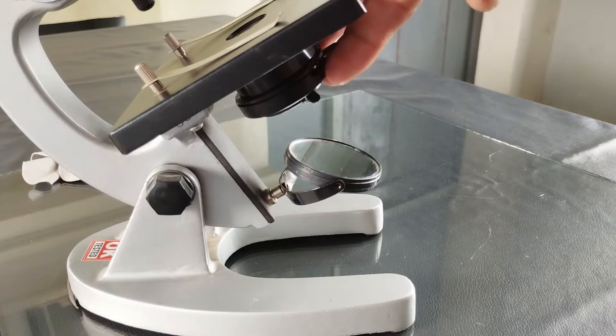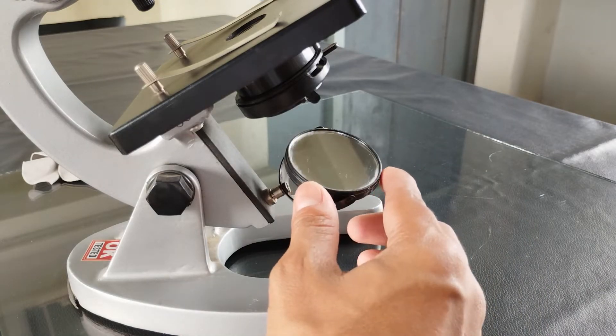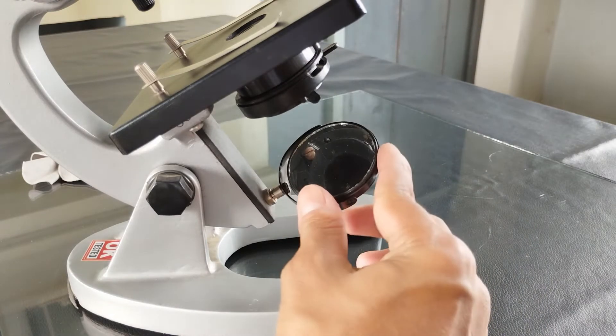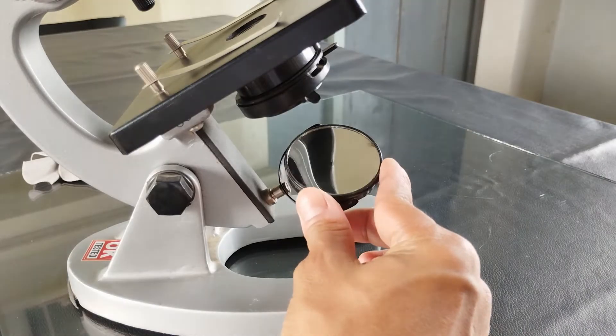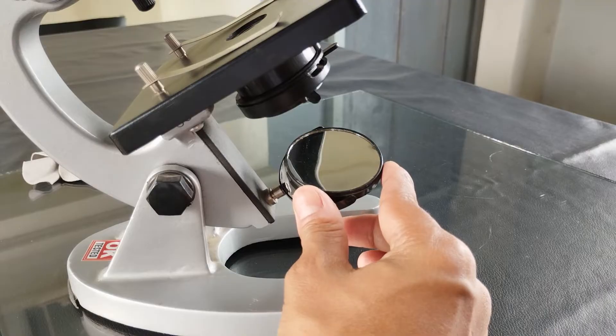If the microscope has an inbuilt condenser, then use the plain side of the mirror for natural daylight and the concave side for artificial light source. If the microscope doesn't have a condenser apparatus, then always use the concave surface of the mirror to reflect light.